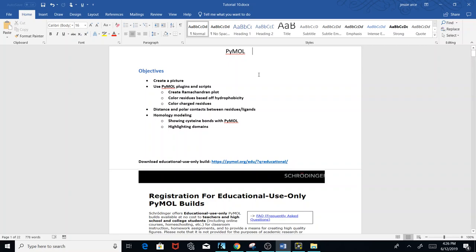Hello, this is Jesse, and in this tutorial we're going to be using PyMol. The objectives include creating pictures of different protein structures, using PyMol plugins and scripts — a plugin to create a Ramachandran plot, and scripts to color residues based on hydrophobicity and charge. We're also going to use PyMol to get the distance and polar contacts between residues and ligands, and at the very end, do homology modeling with the Swiss Model web interface, showing cysteine bonds and highlighting domains.